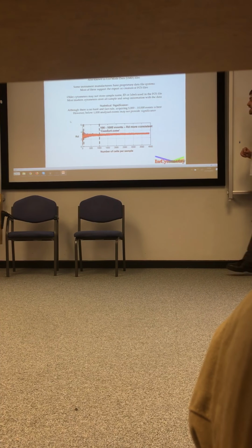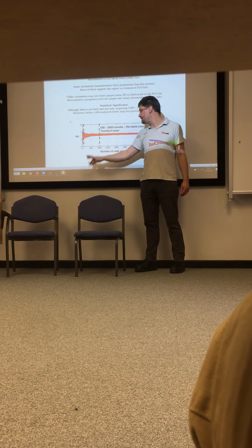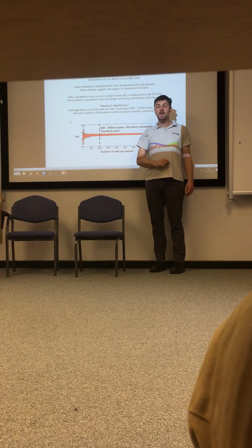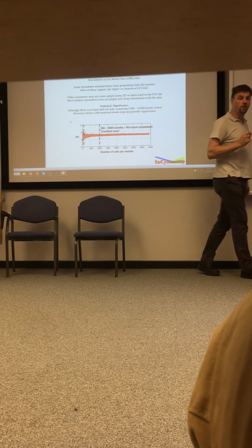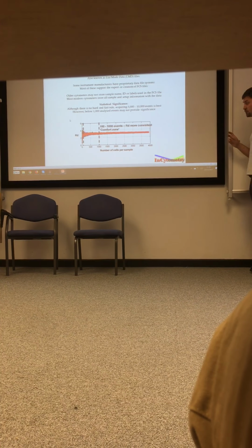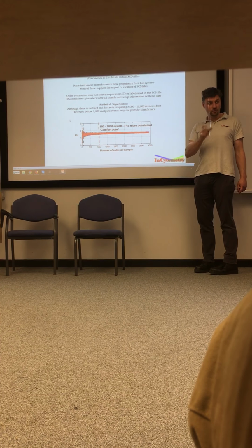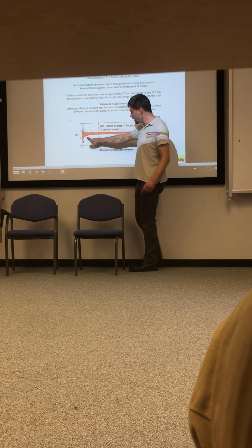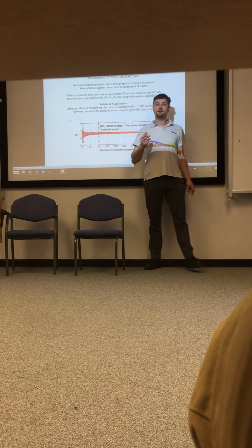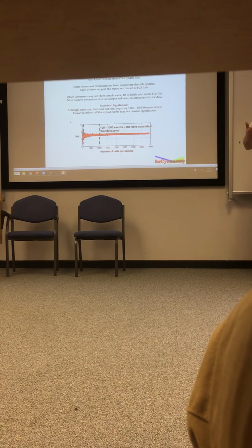So this is a good guide to how many cells you need for statistical significance. Really, above that line, you're pretty much there. But what you've got to remember is your cells of interest. It's not total cells. If you acquire 10,000 events, but there's only 200 of your cells of interest, you're down in this region. Now, I mentioned earlier that person who runs their sorter all day and ends up with 100, 200 events. They have no choice.